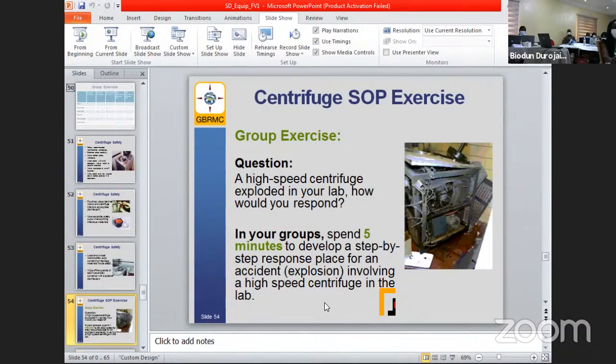Evacuate. What's the spelling of cordon? Somebody spell it. C-O-R-D-O-N. Is there an E? It depends. C-O-R. Okay, we are in grammar class now. We need to get the correct spelling. So what is missing here is R. I should remove the E. Cordon of affected area. Okay? There's an explosion in our lab.